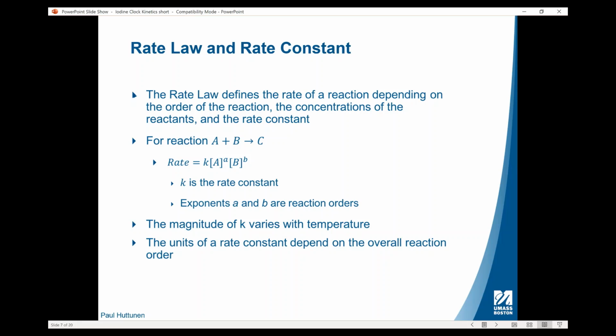And we will also see that the magnitude of the rate constant K varies with temperature. So a few of our reactions will be performed at different temperatures while maintaining the same concentration of our reactants.